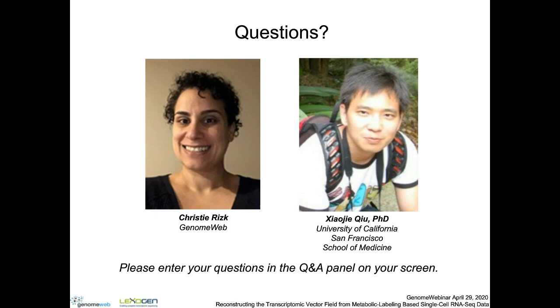In terms of the sequencing, can you tell us what your shortest and longest reads were, and then your average read? And also, did you do any analysis afterwards on the length reductions through the velocity path?